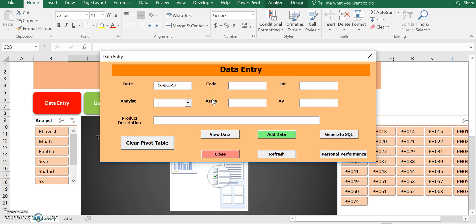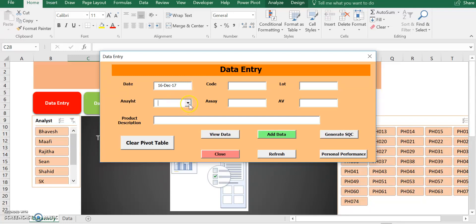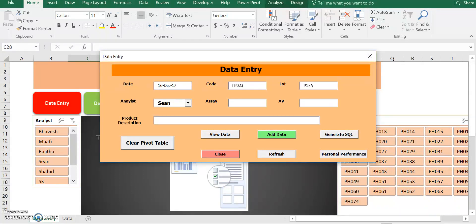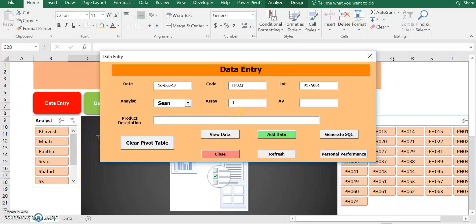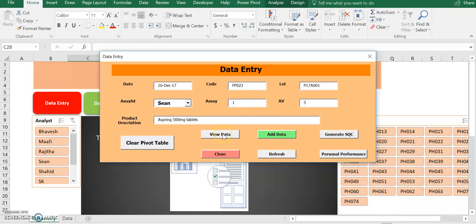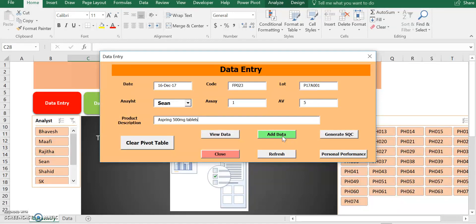Now, when I hit this button, a user form is going to pop up. As you can see, I have pre-entered, I built this VBA so that the data is automatically set on today's date. So this is just for convenience. You don't have to do this. So let's try this. We're going to pick an analyst. I'm going to pick myself. Product code, I'm going to make up a number. Finish product, 023. Lot number, I'm going to say P17A001. And assay, I'm going to say 100%, which is just 1. Average variation, which is content uniformity, I'm going to enter 5. And product description, I'm going to say this is an aspirin product. So aspirin, 500 milligram tablets. Now, in order for this to go into a data form, I have to click this button, the add data button, to add data. So once I click, they all disappear.